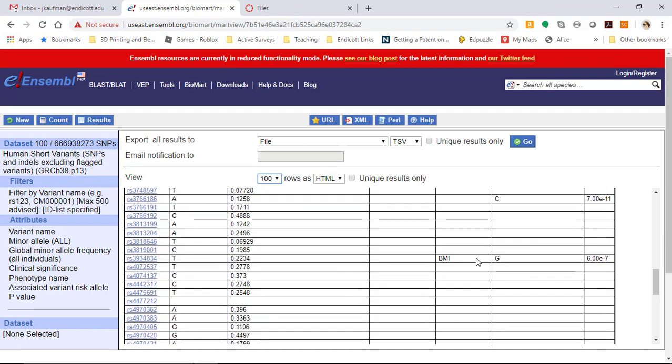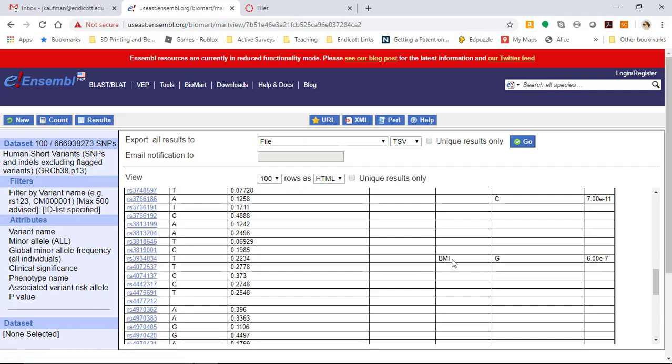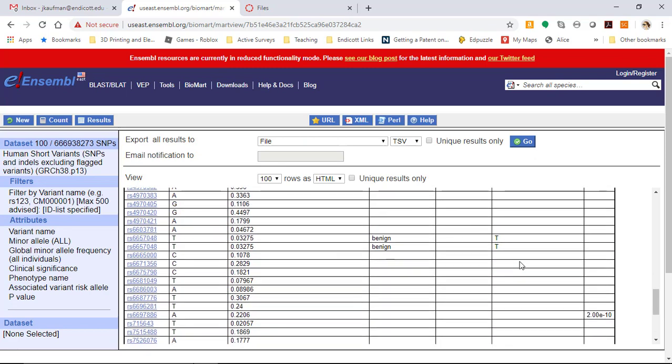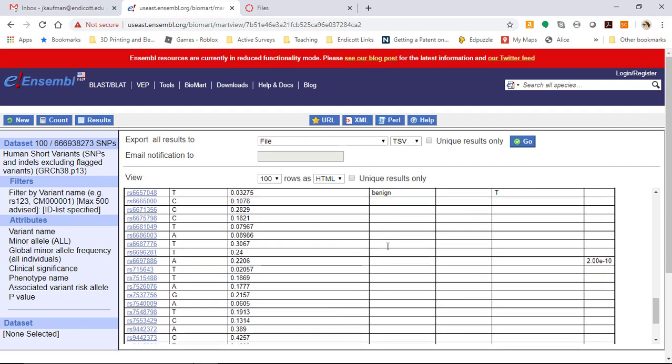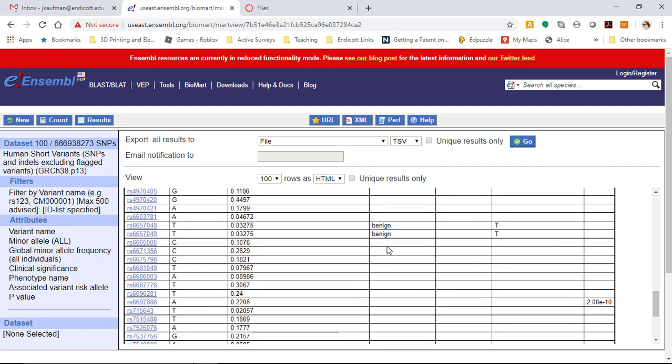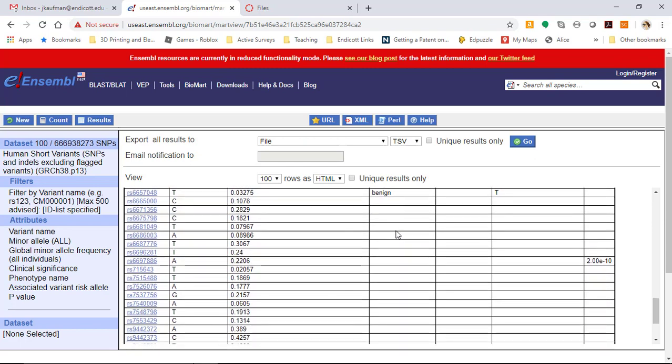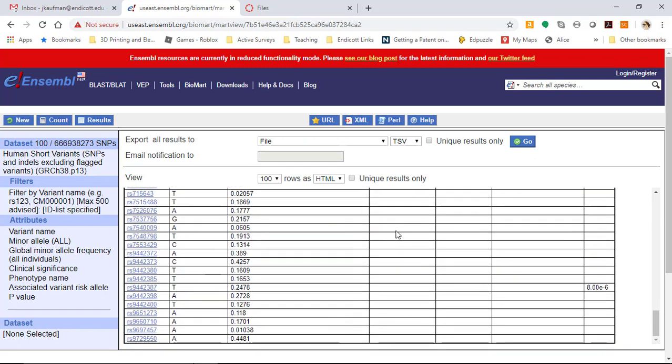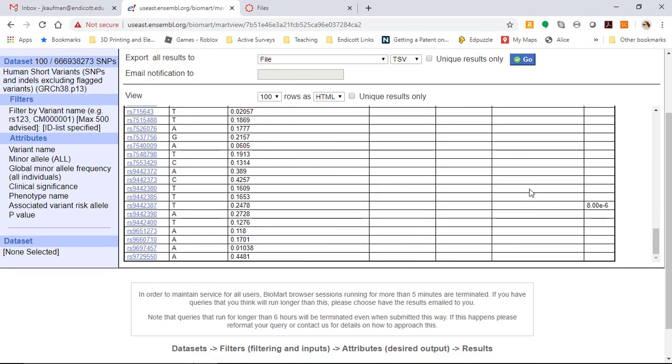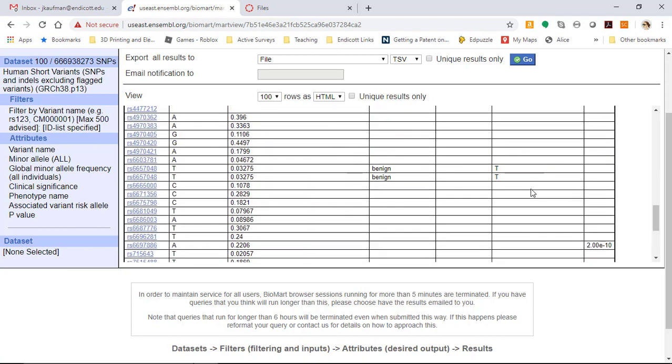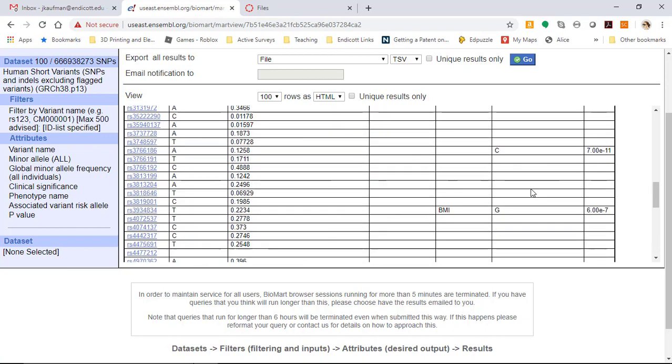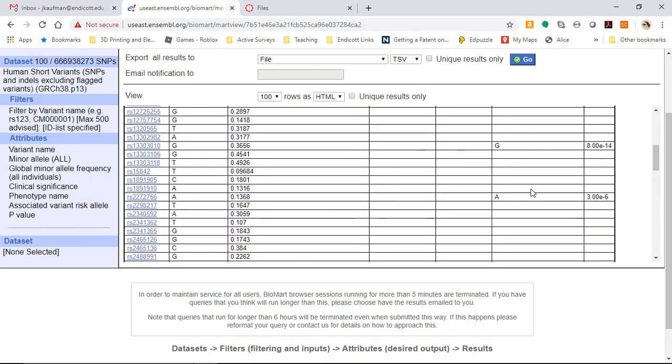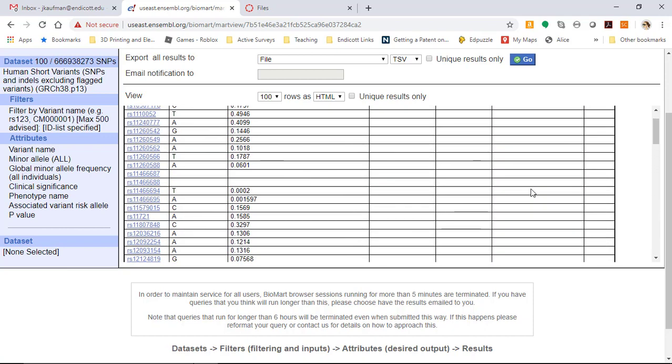We can see some of them have a phenotype name. rs3934834, the one you guys looked for last week as your homework assignment, is associated with increased BMI for individuals that have a letter G. These SNPs have a benign clinical significance, so they're associated with genes associated with disease but they don't increase the chance of the disease. A couple other SNPs have p-values associated with them, so they may have some interesting data.